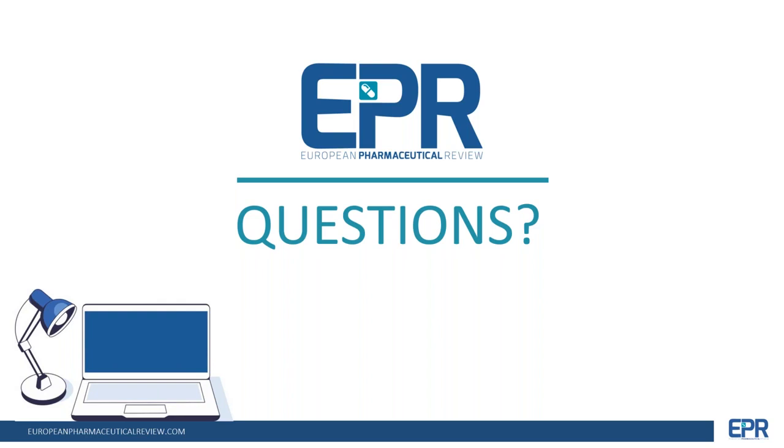Okay, moving on, another question. Somebody asks, could ETD be a reasonable technique for oligo sequencing despite the relatively low charge states? Who can answer that one? Yeah, I'll take a crack at it. We don't really know for sure yet. We haven't run this on any instruments that have ETD fragmentation capability. I think there's no fundamental reason why it can't work. As Adi showed, we are still generating multiply positively charged ions, and so we don't know for sure what the efficiency of the fragmentation will be, but it certainly could work.